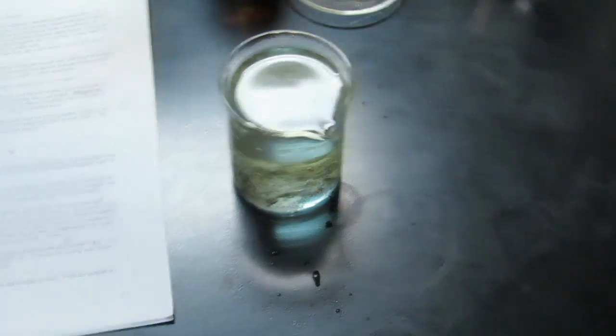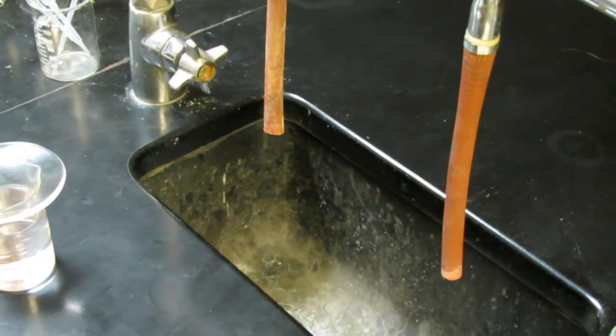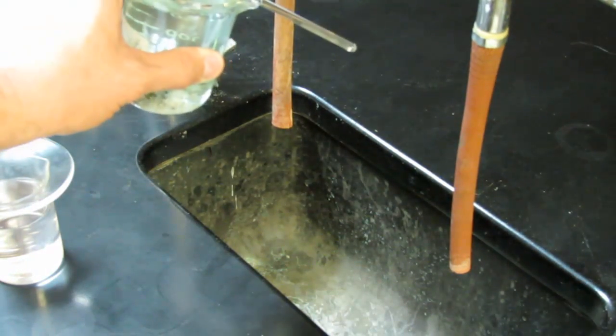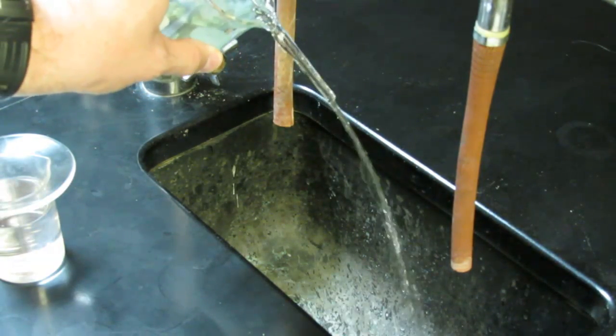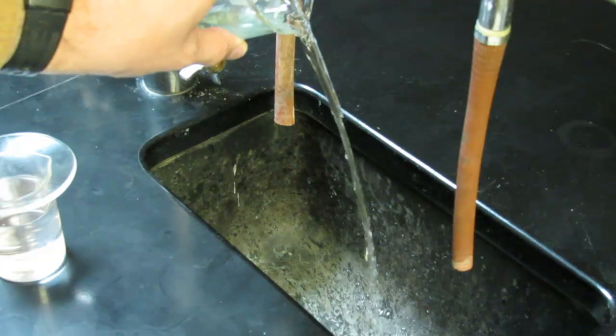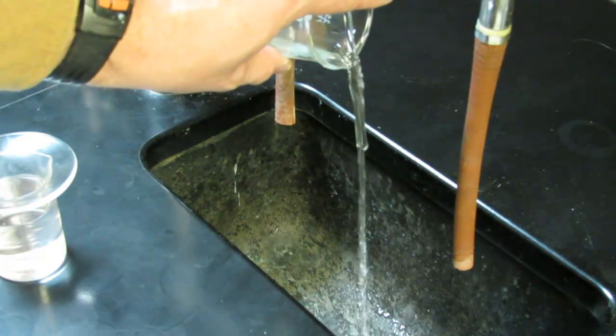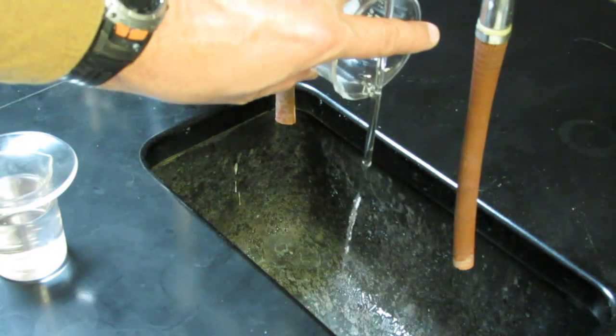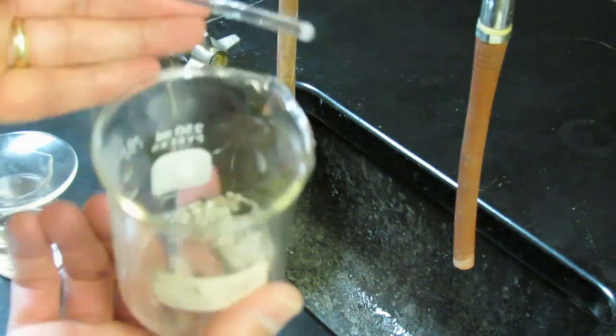To decant we'll do that into this sink over here. We're going to hold our stirring rod over top of our beaker like this. And when we pour the water out you'll notice that the water goes right down the stirring rod. Isn't that nice? We'll pour that water off. We're decanting it right into the sink. We're trying not to shake it too much because we don't want any of the silver to go down the sink. And you can see we have our silver there.